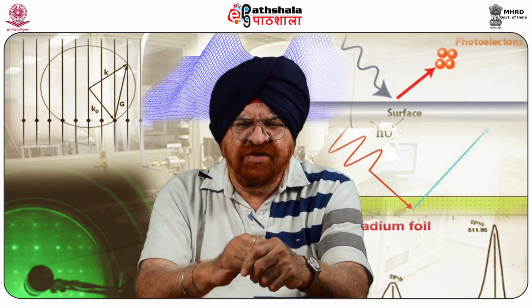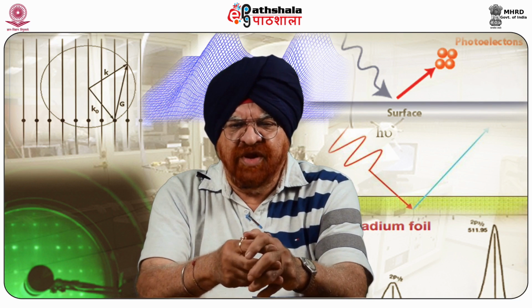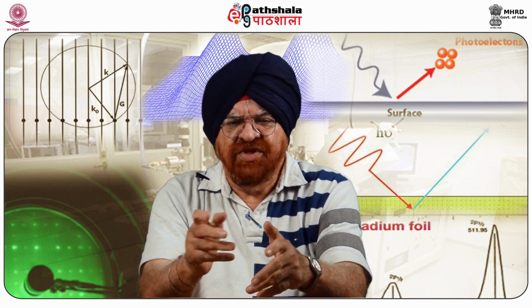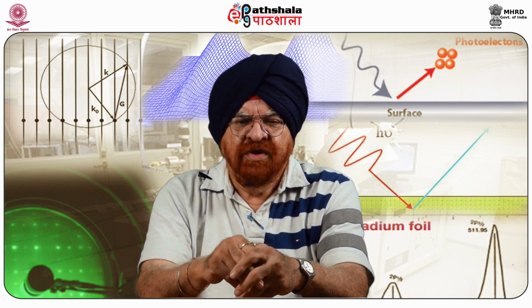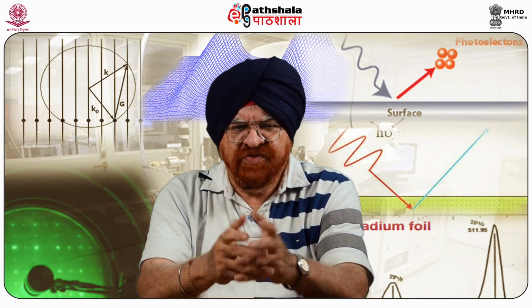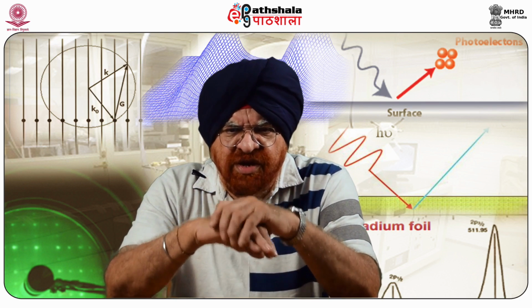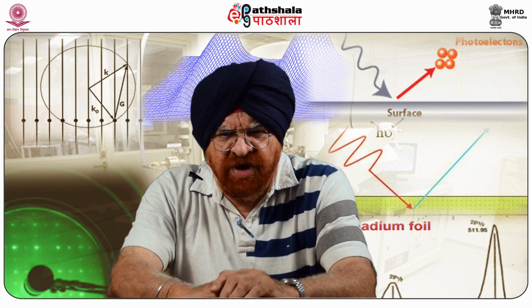Then contaminations, if any, which exist on the surface or in the bulk of the sample can be very precisely measured with the help of the spectroscopy. Then the empirical formula of a material can be found out, which is a big help to the analyst. The chemical state identification can be done very accurately, and local bonding of one or more of the elements in the sample can be very precisely calculated.